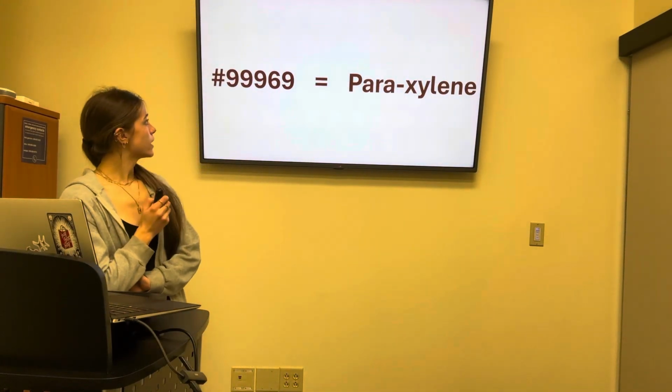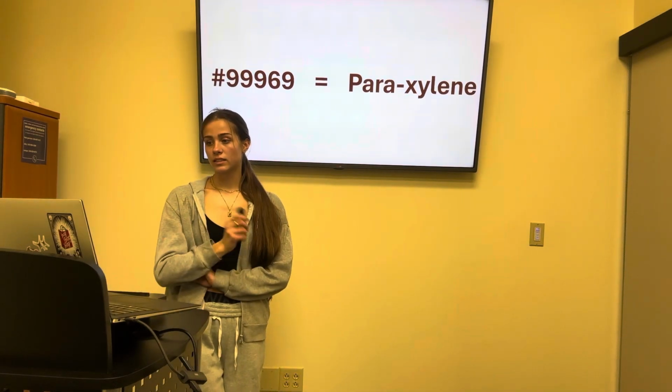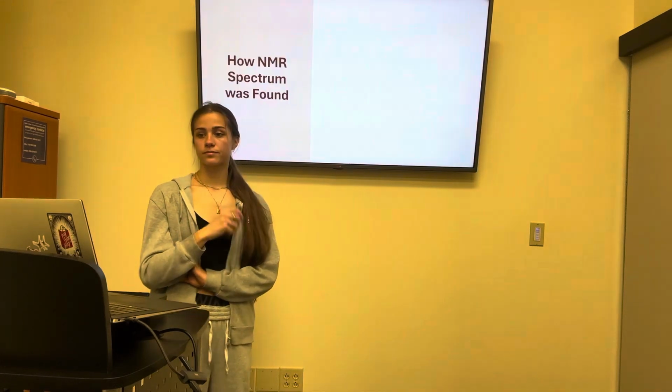So sample 99969 was found to most likely be the compound paraxylene. Sample 05024 was matched with ethanol, and vial number 43 was found to be methanol.